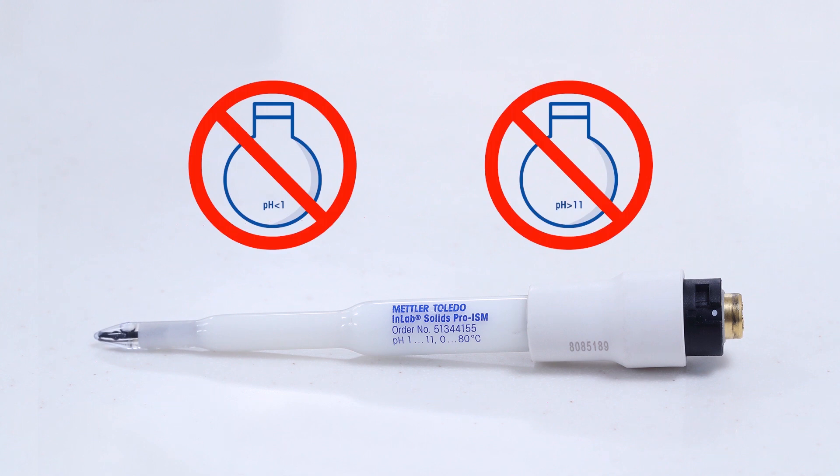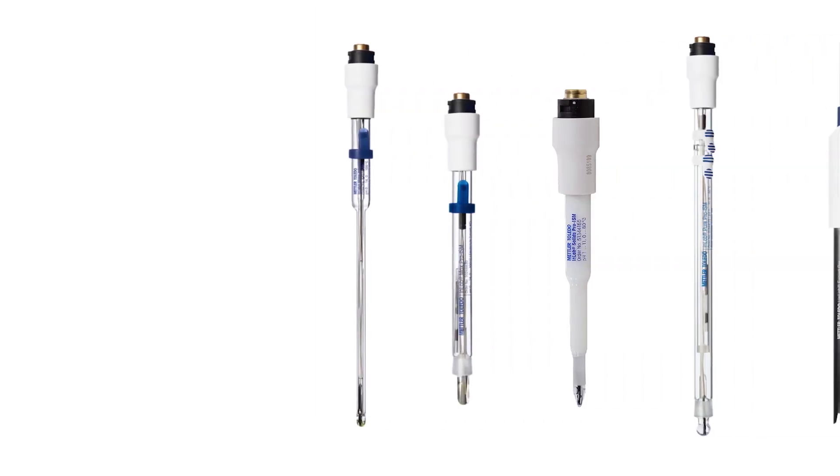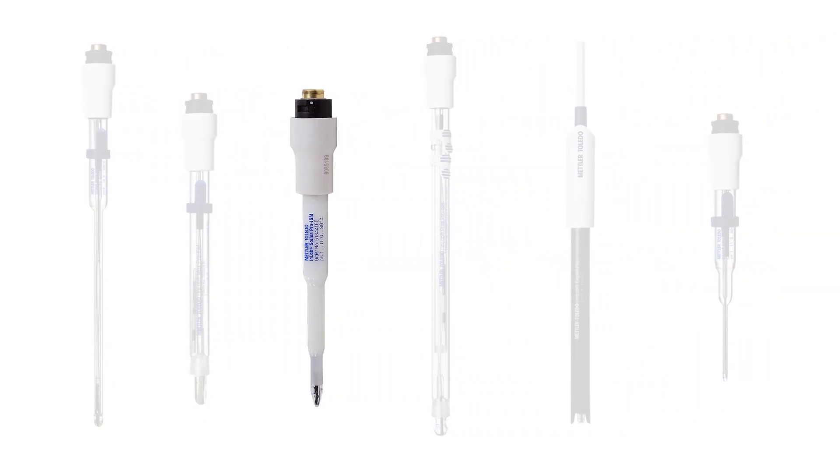And hence, it should not be exposed to harsh acidic or alkaline chemicals. Make the right choice of electrode for your application to achieve higher accuracy.